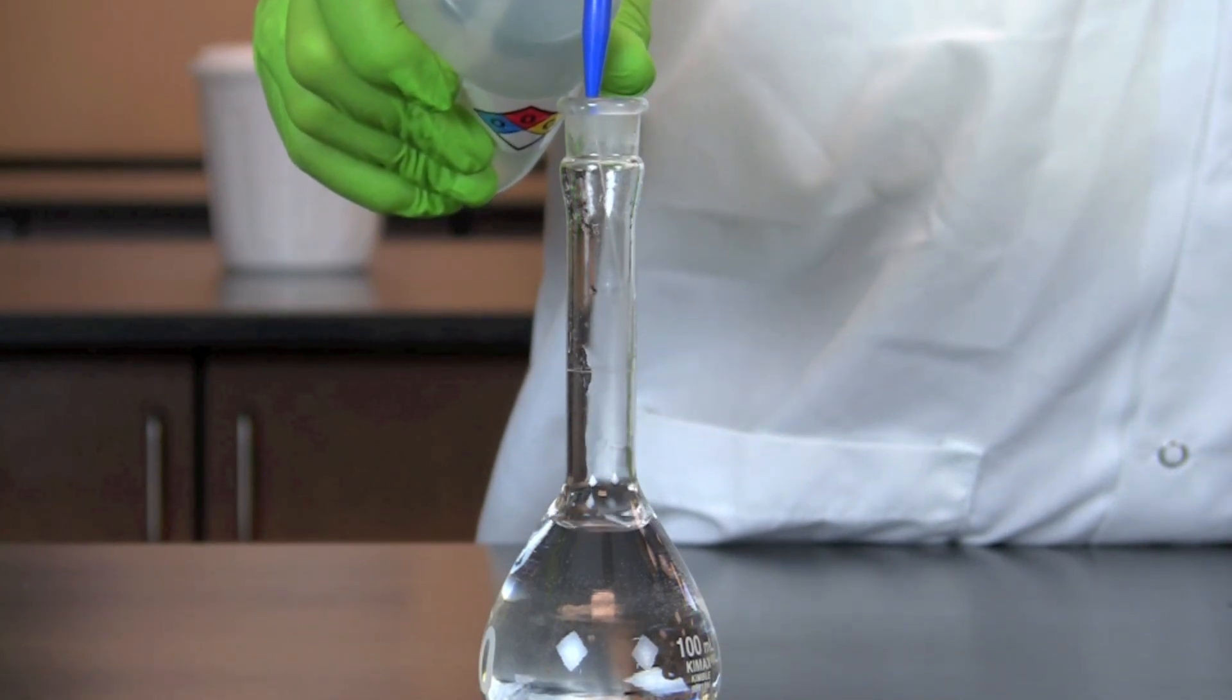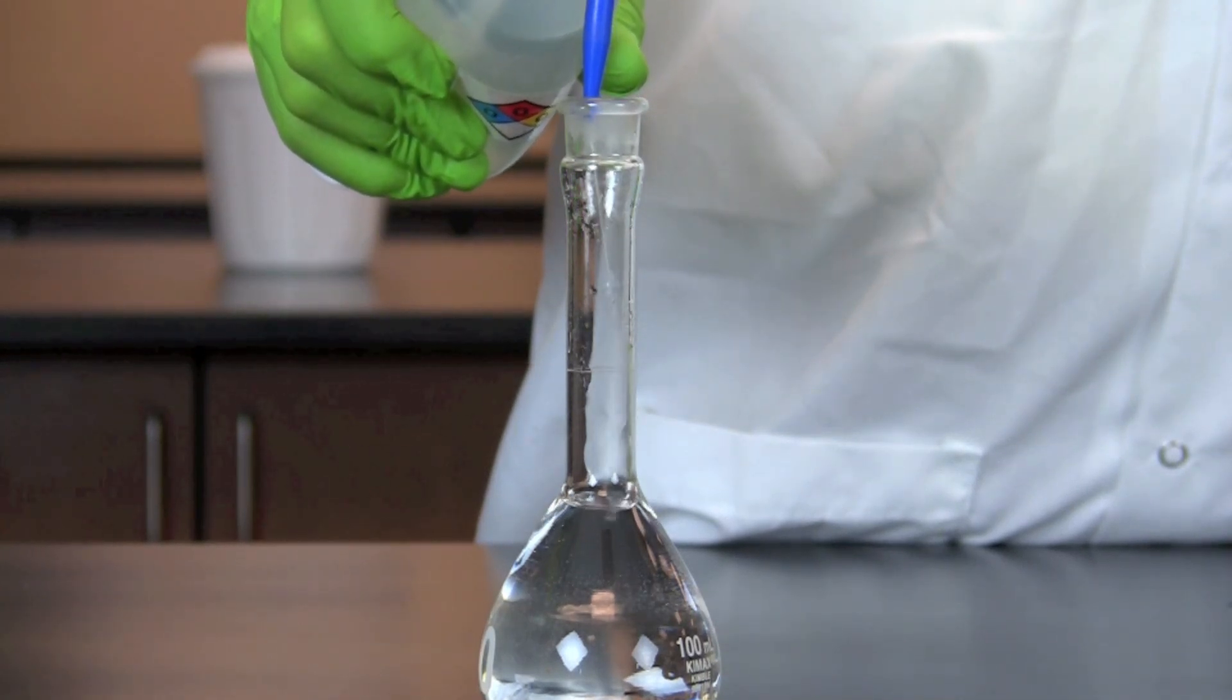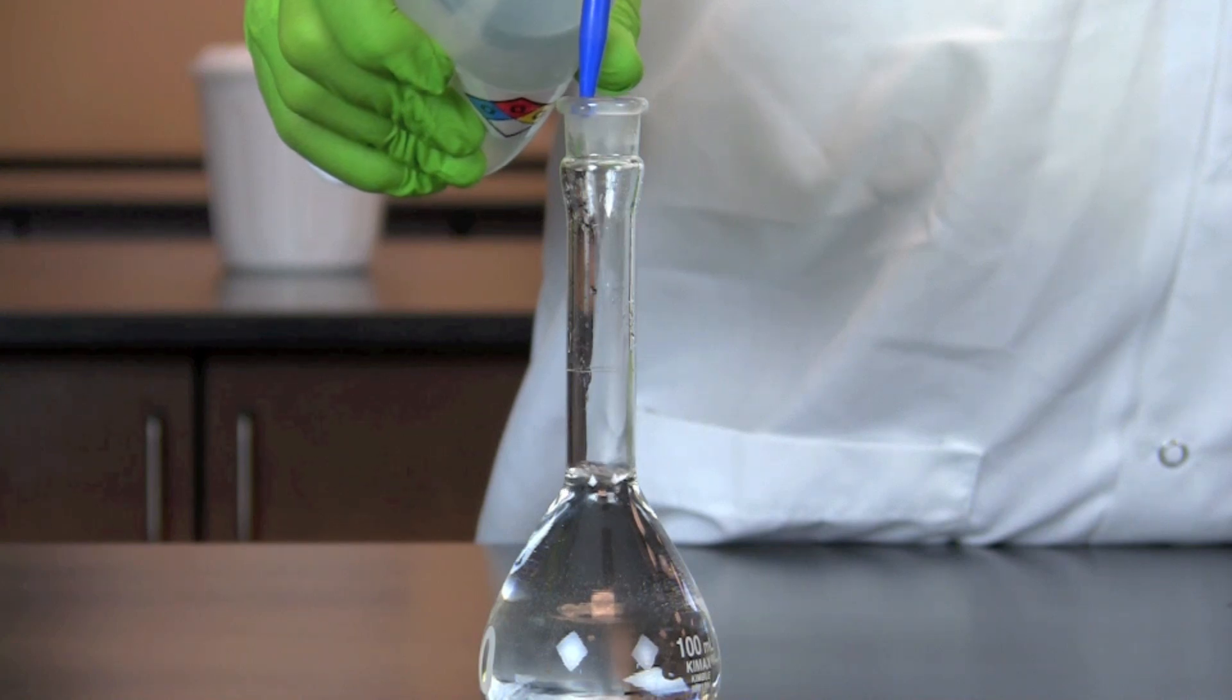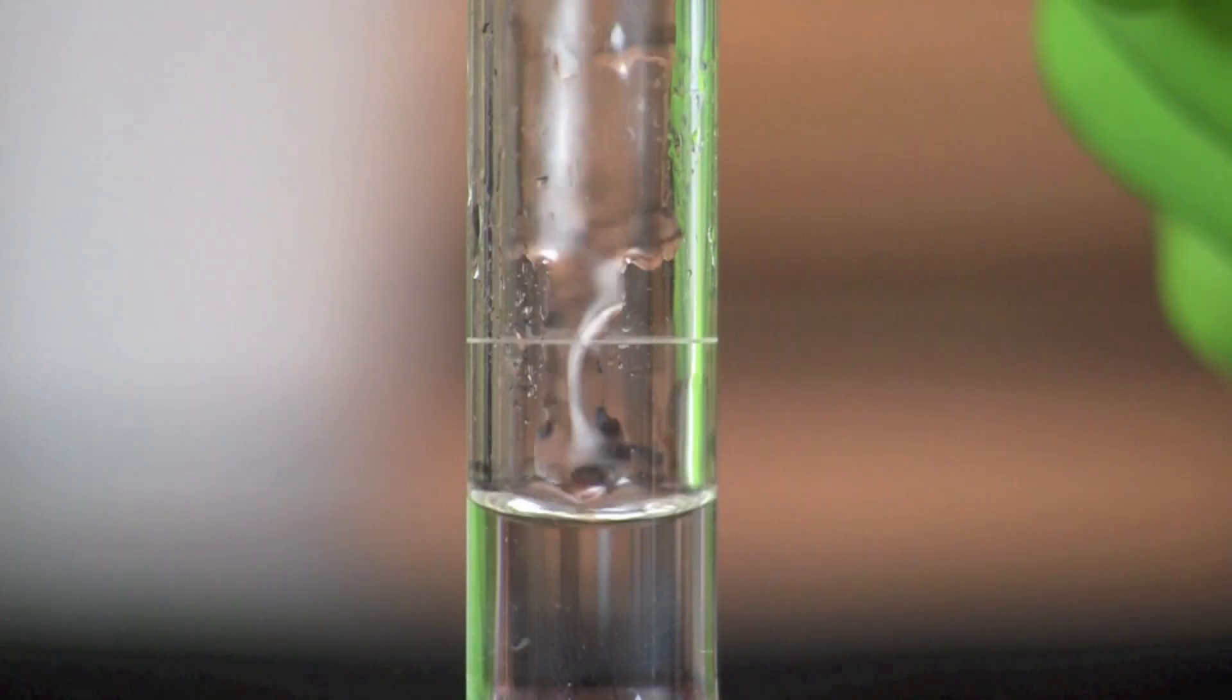Once all of the sodium chloride crystals are dissolved, carefully add distilled water to the flask until the meniscus touches the etched mark on the neck.